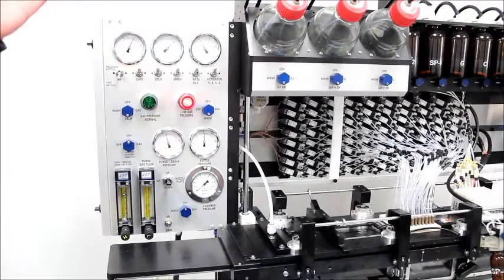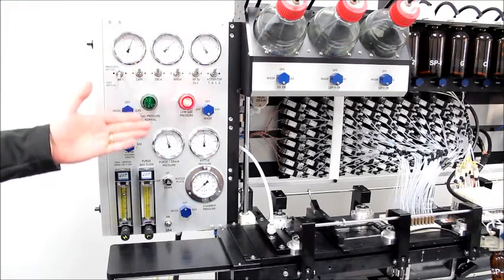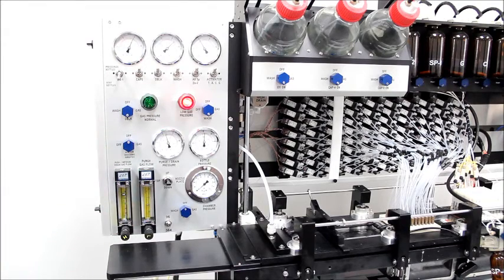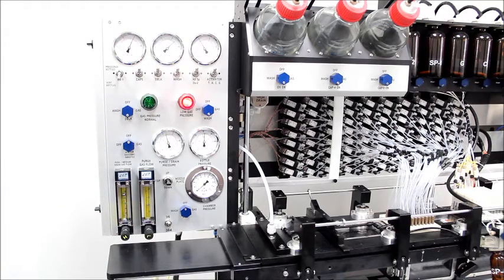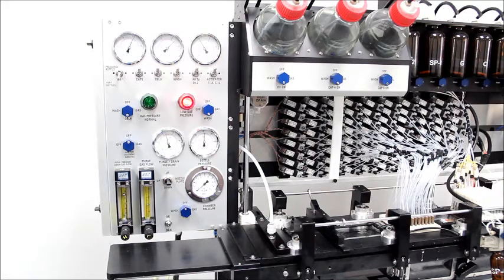The control panel contains the gauges and switches that regulate the flow of gas to the bottle pressurization system and the purge and drain pressure system.